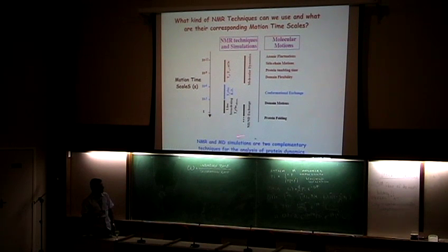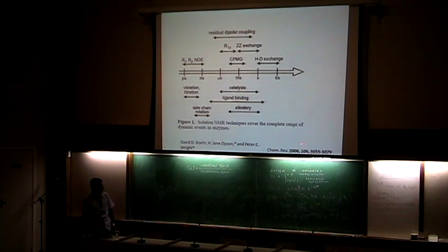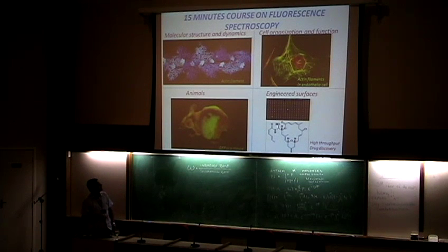And of course, I cut that part of my talk too, but especially when you are using T1, T2, and nuclear Overhauser effects, one can compare a lot with molecular dynamics in the nanosecond time scale. That's another representation. This review is quite nice. Although I'm the coordinator in this NMR center, I don't know too much NMR, so once in a while I read the reviews, and this one is quite good, especially in showing how one can tackle several problems in biology. In this case, it was specific to enzymes, and a lot of the questions about enzymes can be approached by NMR.